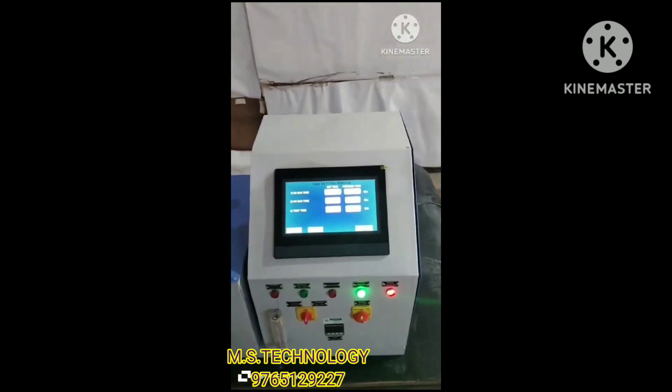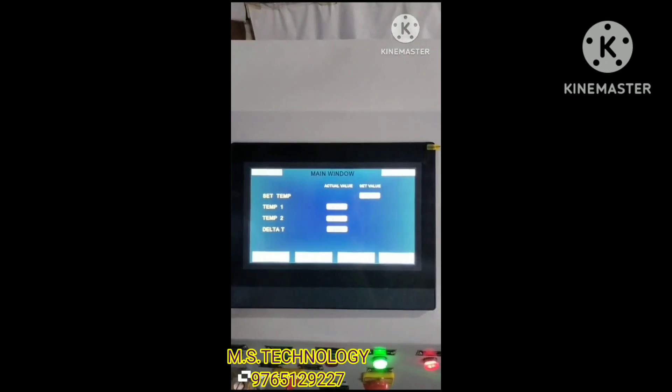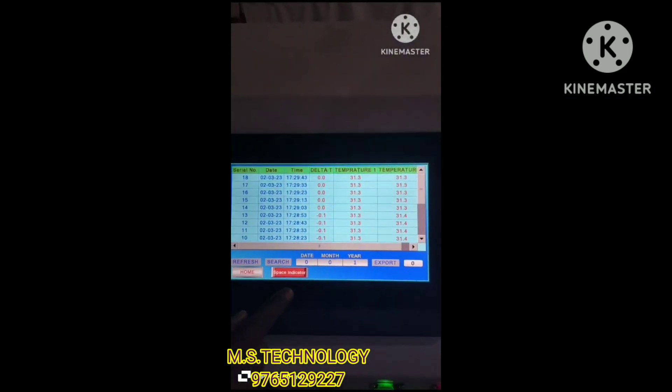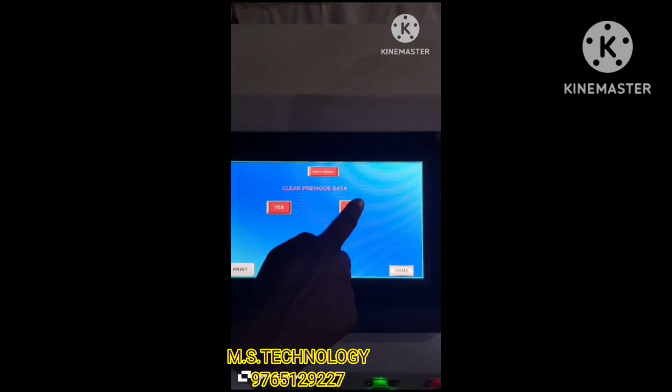Now we will look at the settings we have to make. Click on data login. Here is the previous data — we have to erase all previous records. Click on the space indicator, then clear the previous data and click yes. The data will get cleared. Now go back to the home page.